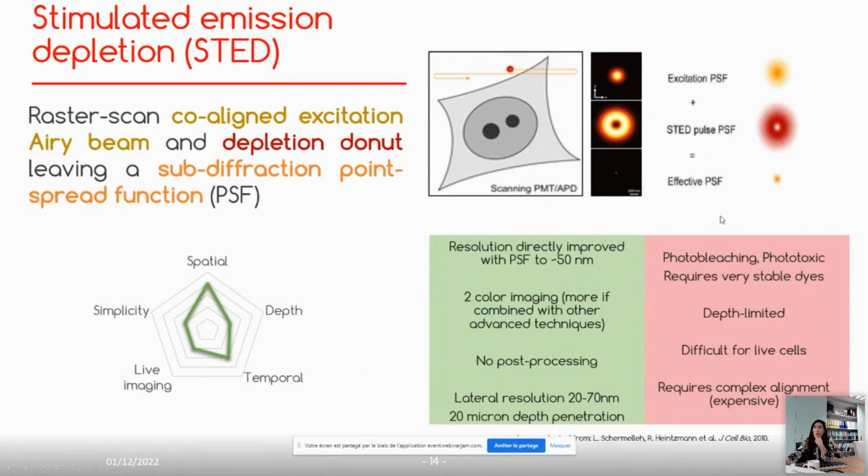Finally, at a conference I was recently at in Spain, we had a whole session on discussing both STED and another technique, STORM, and there are some real challenges to the necessary alignment. These 2 beams need to be perfectly aligned in order to get the accomplished effect. So this does take some expertise and someone that really knows quite a bit about handling their lasers.